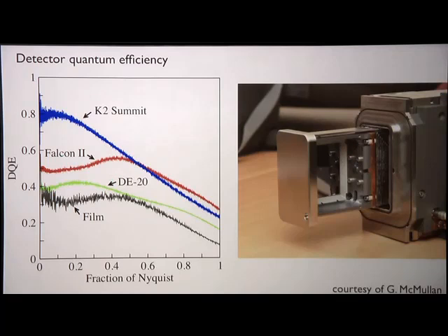I mentioned one other detail. This lower resolution information here is probably quite useful for doing the alignment of particles, and so there may be some advantages to using this one in particular circumstances, but there may be other, mostly advantages to having the high frequency information here. But as these get better and better, which they will, these curves are going to go all the way up near 1, and Richard promises me that we're going to be up here soon, so that will be very exciting.